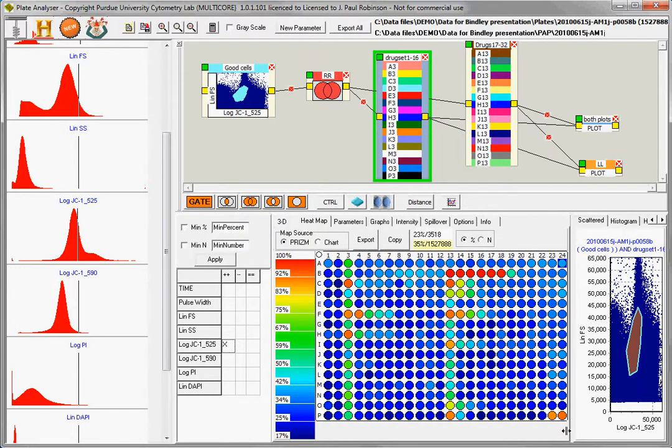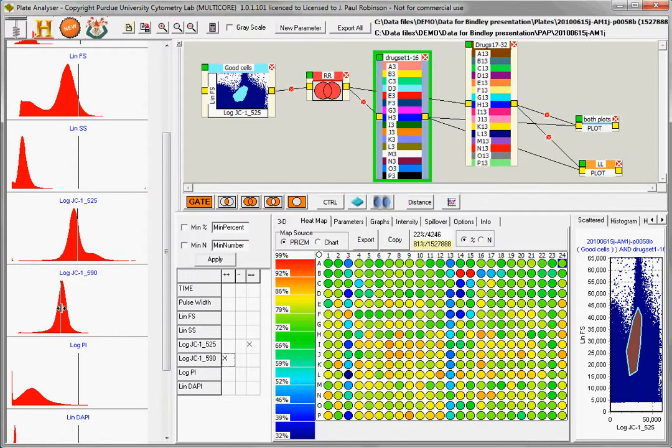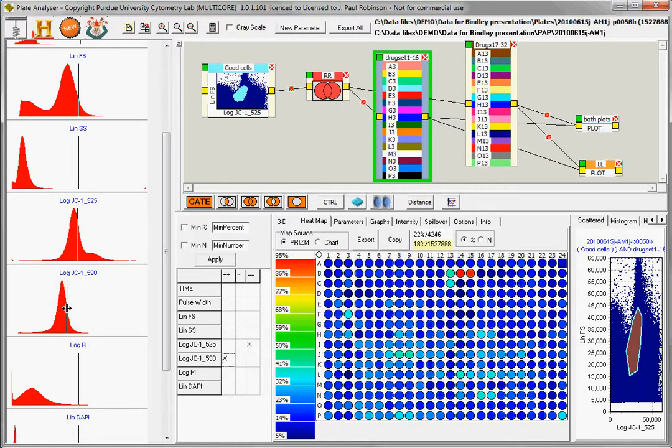And down here are our controls. They are positive controls for this particular assay. So that's the basics of whatever you click on here, by the way. You can show the same thing. And actually there's some very complicated things you can do, but I'm not going to show you those right now.